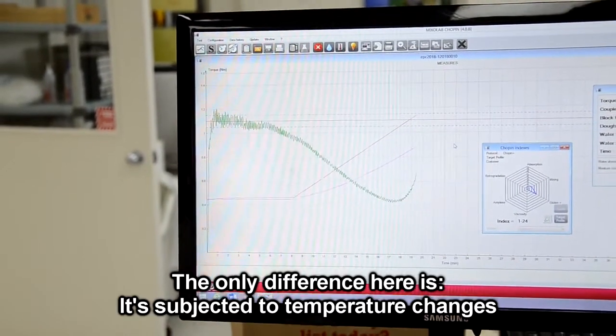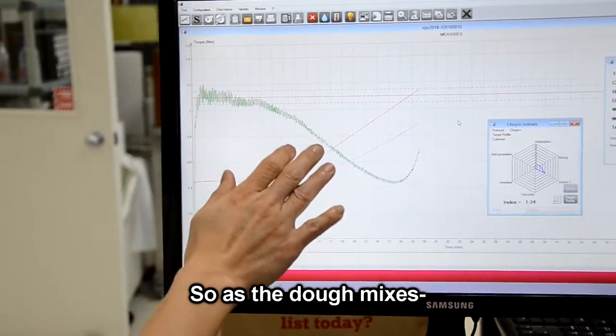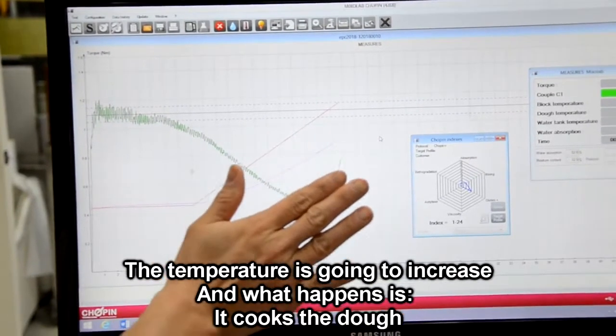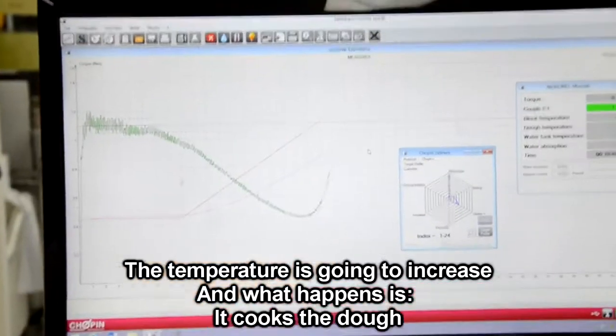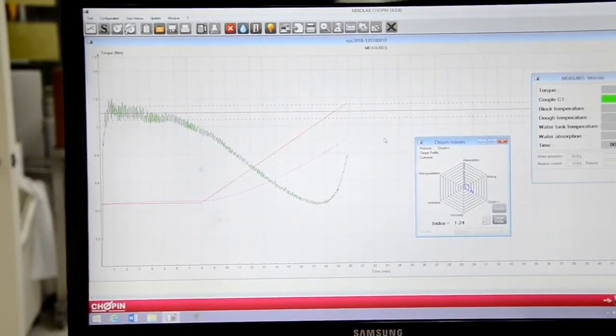The only difference here is it's subjected to temperature changes. So as the dough mixes until 8-9 minutes, the temperature is going to increase. And what happens is it cooks the dough. So you're in the middle of a test right now, and we will talk about the graph when it's done.